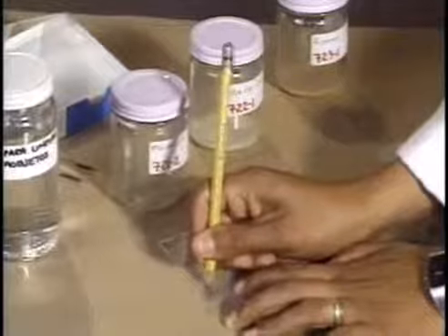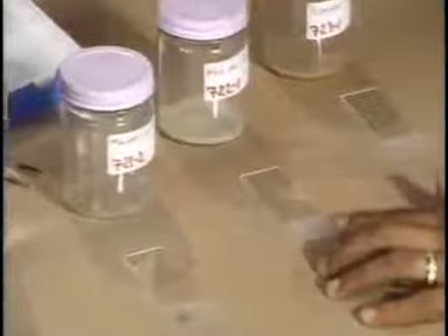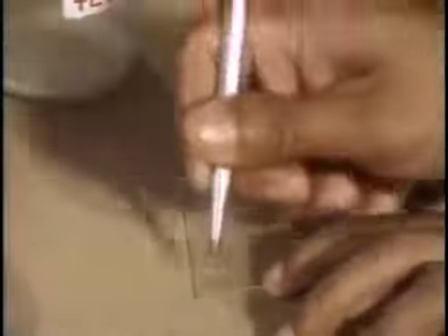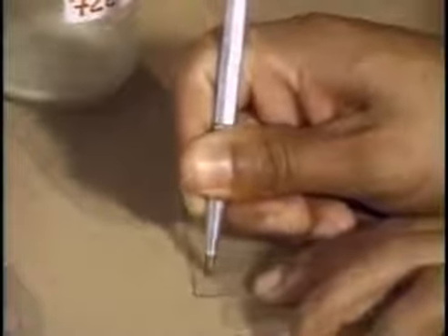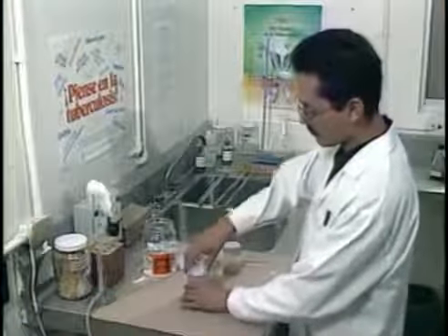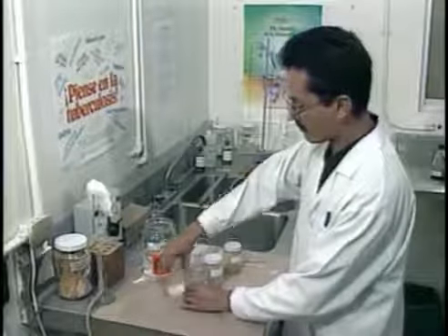Properly identify each slide with the laboratory and specimen number. Use a lead pencil to write these numbers on the frosted end of the slide. If the slide is not frosted, engrave the laboratory serial number using a diamond-pointed stylus. Never use a grease pencil, since markings could wash off during the staining process. Open the container slowly to avoid producing aerosols.